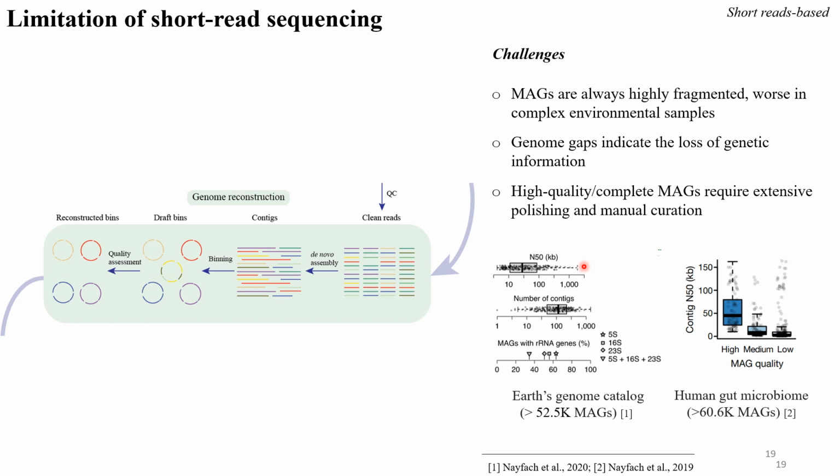Even if sometimes we have the opportunity to recover a complete genome using the traditional short-read sequencing, it requires intensive polishing and manual curation, which is difficult to apply for large-scale studies. It's also very difficult to recover real high-quality genomes.